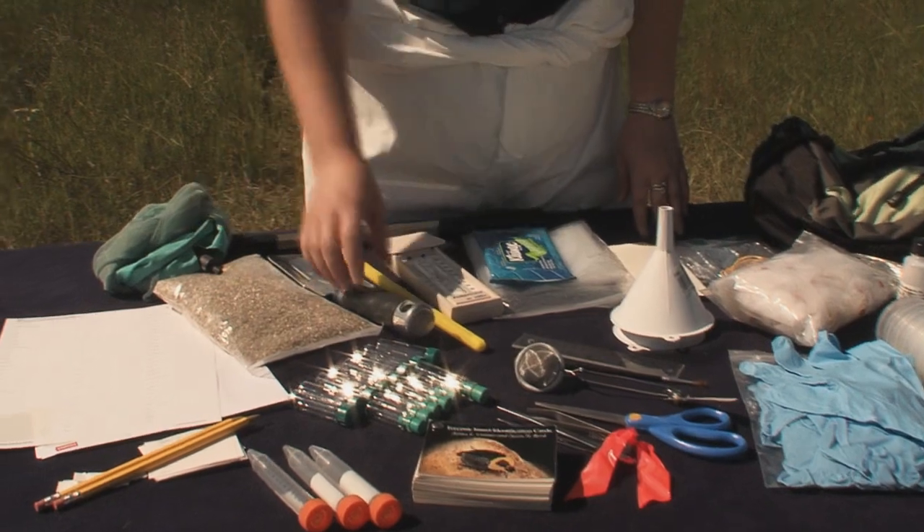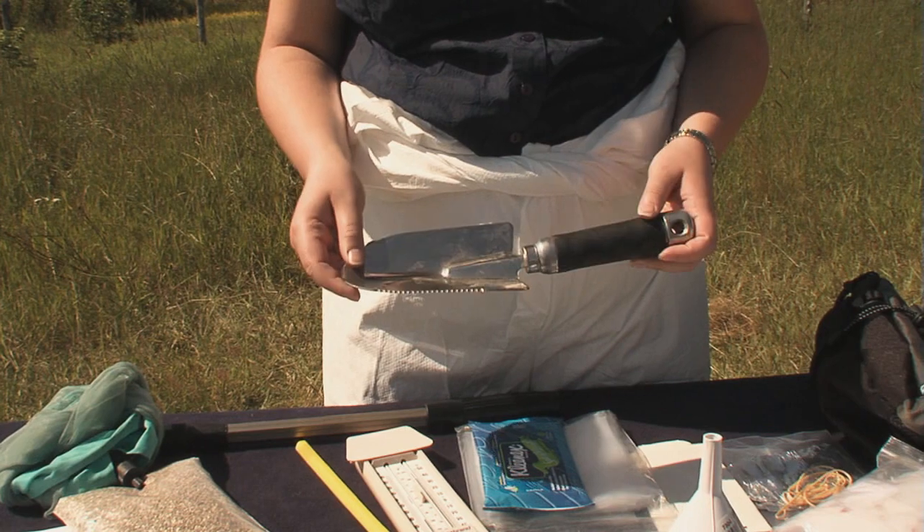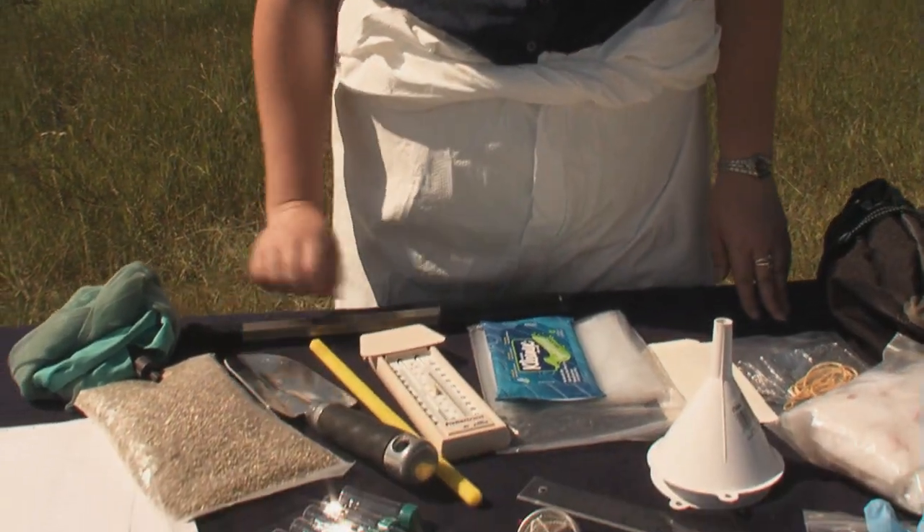We start out with things like a garden trowel. If it has a serrated edge, that's really good. It's useful for taking soil samples, which you might need from the scene if you have to look for puparia in the soil.